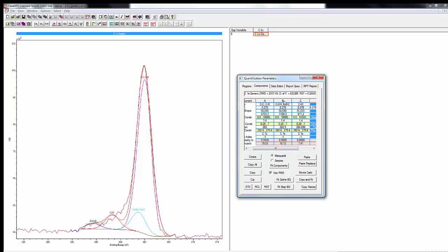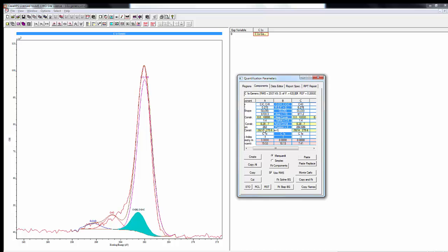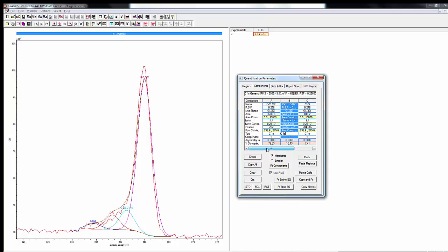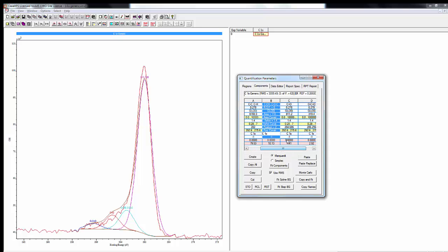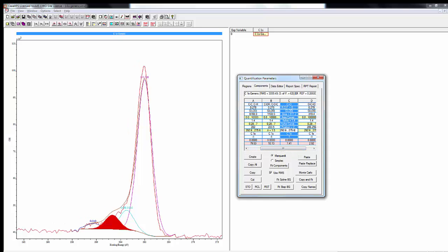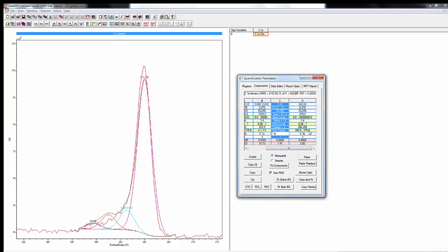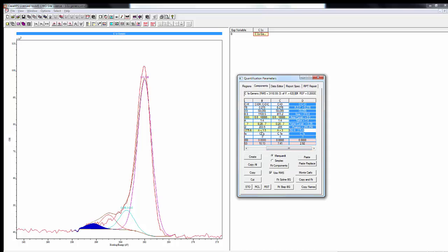The alcohol peak generally I set at about 1.5 eV above the aliphatic peak, so we're changing our position constraints to A plus 1.5. For the ketone I generally start with A plus 3, and for our acid functionality and ester functionality we're going to add about A plus 4 to start with.